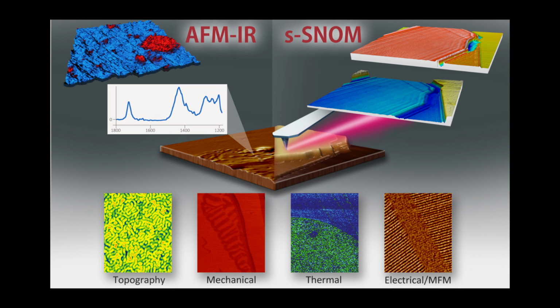And so typically for the quantum cascade laser, we use quantum cascade lasers that cover a range from 1,000 to 1,800. And typically that will require 4 QCLs. Each individual QCL chip covers a narrower range, but we'll use 4 of them together to cover that 1,000 to 1,800. And they do have quantum cascade chips in which they center more at the 2250.